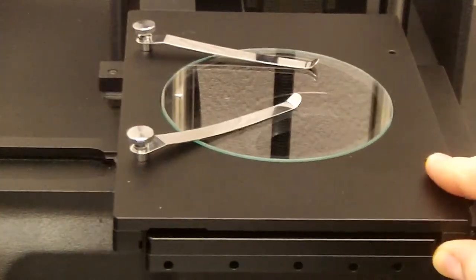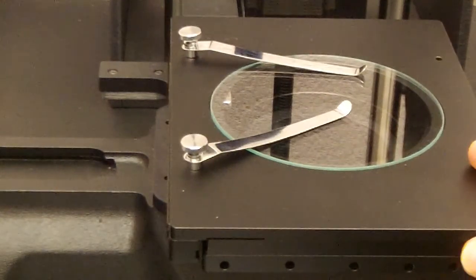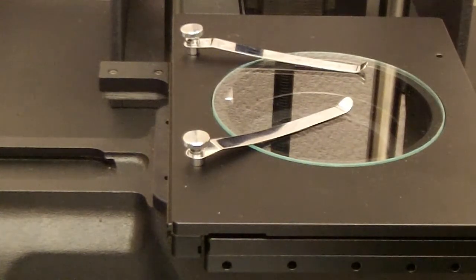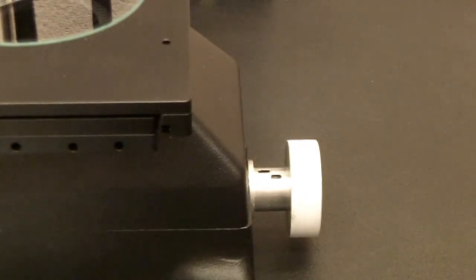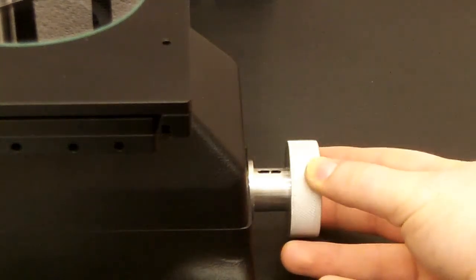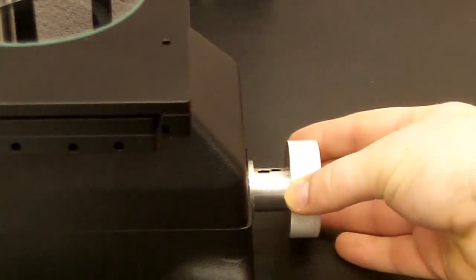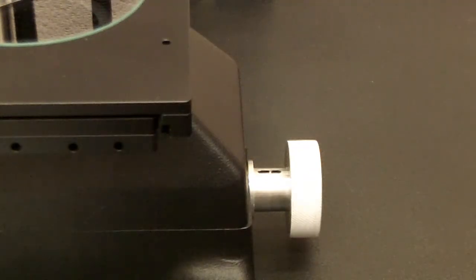You can adjust the position of the stage. Here it is lined up with the internal mirror of the SolMate, and at the furthest right end of the SolMate is the mirror tilt knob. So the mirror tilt knob adjusts the internal mirror of the SolMate, and when these two black tick marks are lined up, the internal mirror is positioned at a 45 degree angle, which will point the light directly up through the specimen.